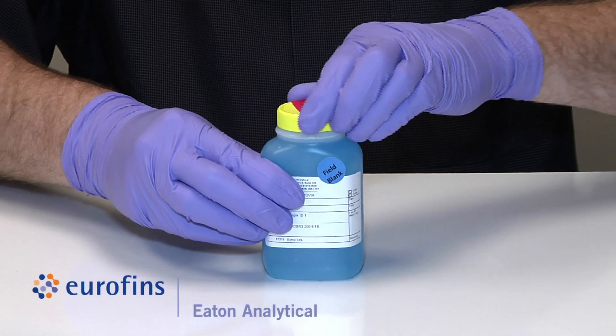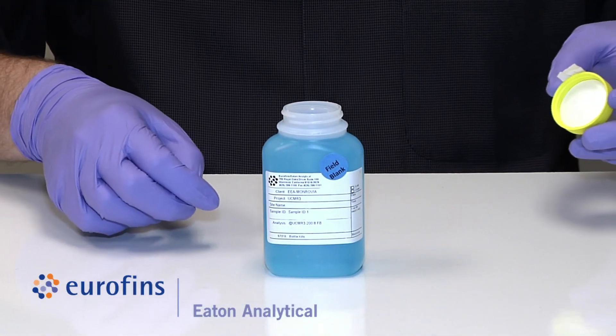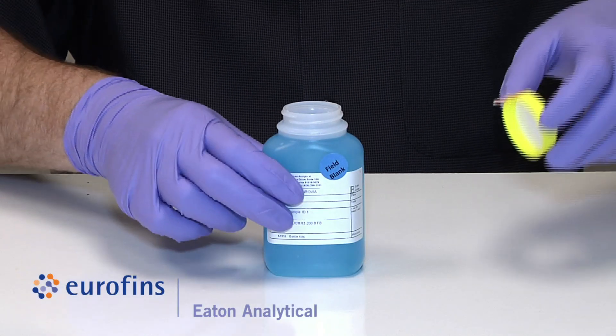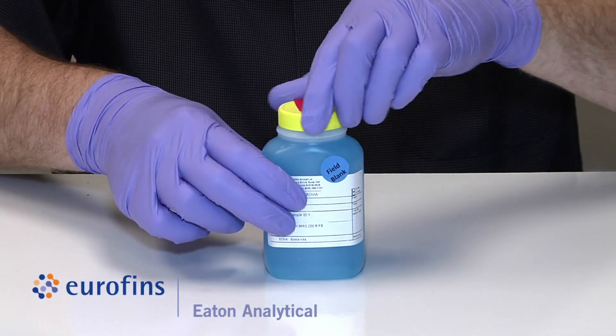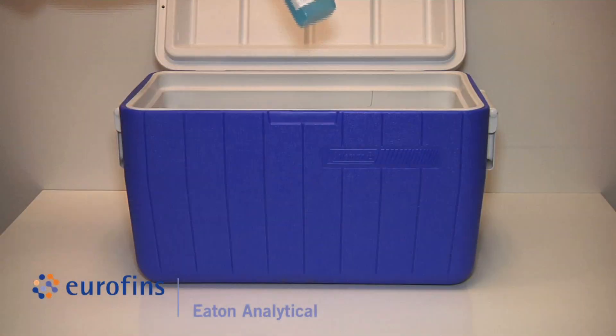The collection protocol for Method 200.8 requires that you open the UCMR 3 200.8 field blank at the site and cap the bottle while at the site, but before collecting samples. Place the field blank into the cooler and ship it back to the lab along with the sample.